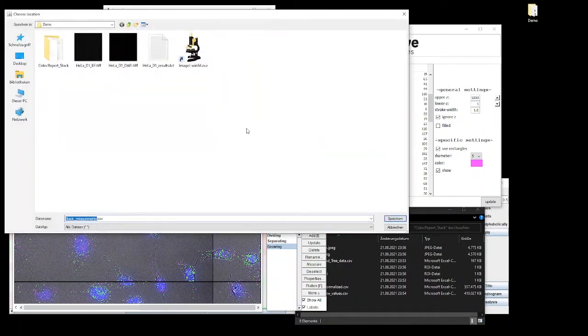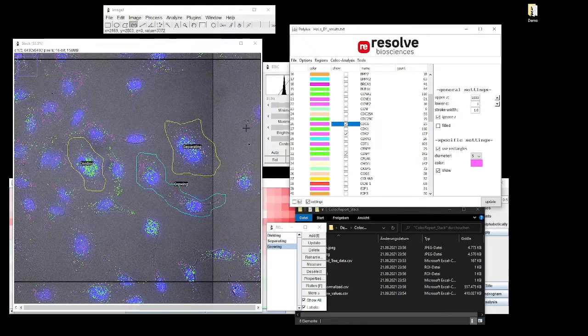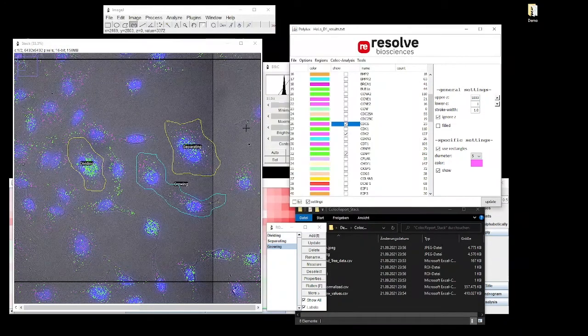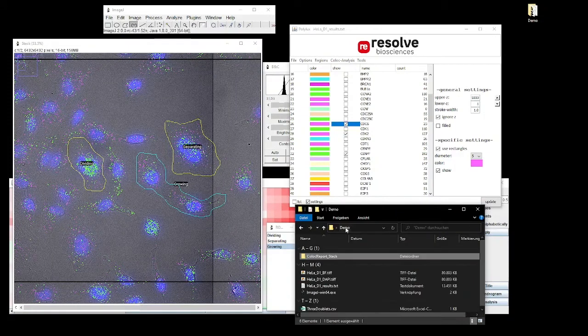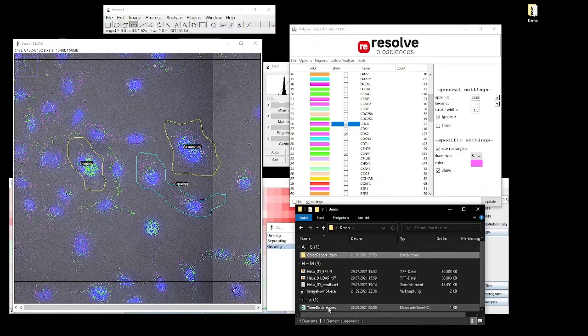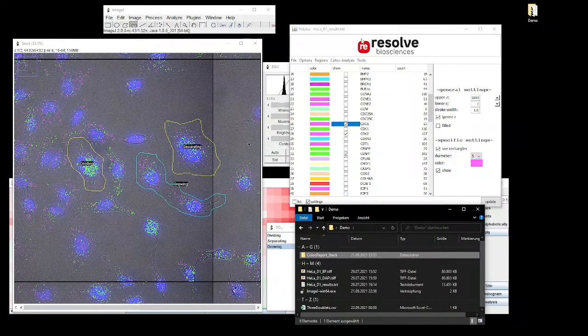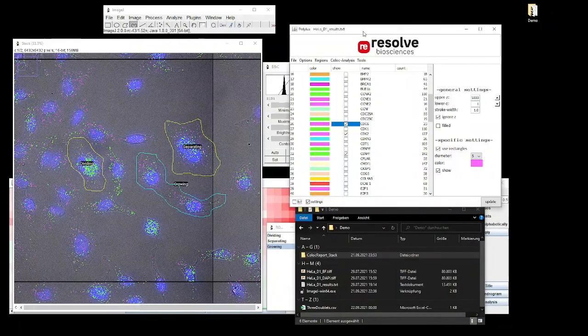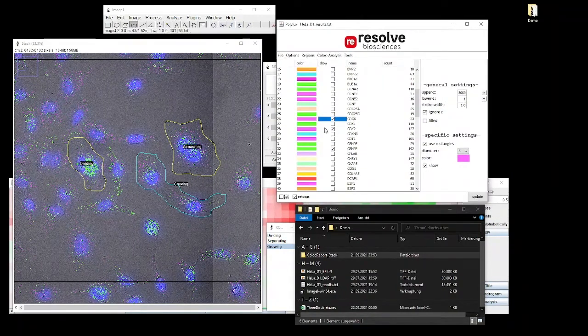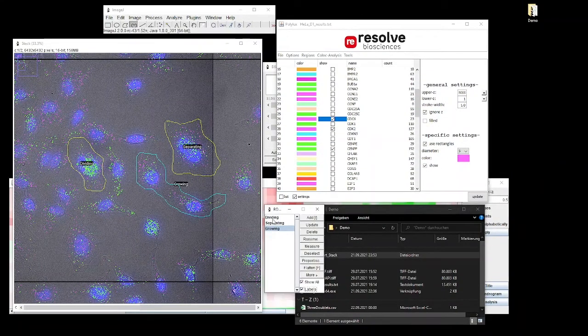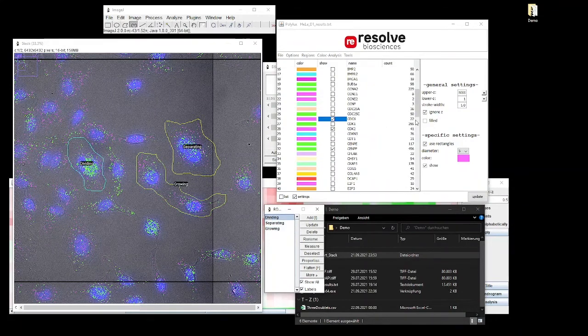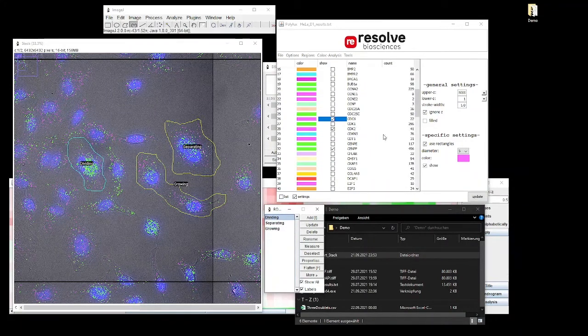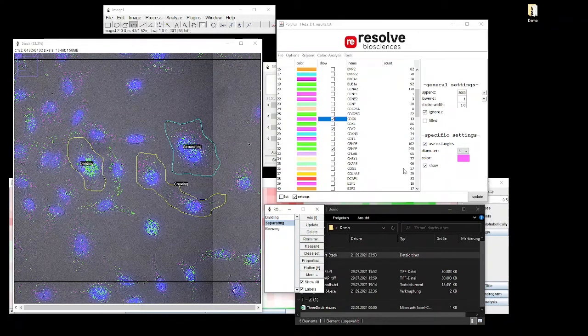Two cells that have just divided, obviously, and then there's two cells where we can see no sign of cell division. We have named these regions and we can now export the data. The data file will give us a count for every transcript in each of these three regions of interest.